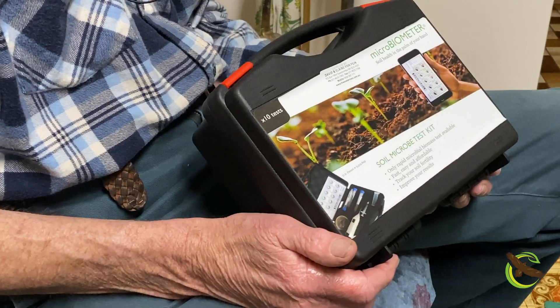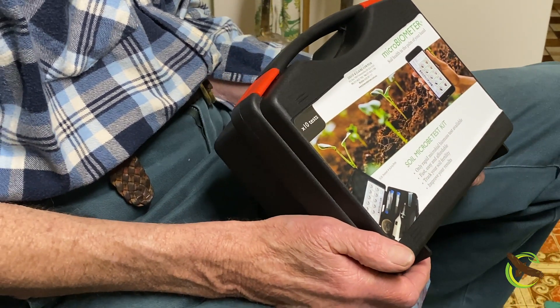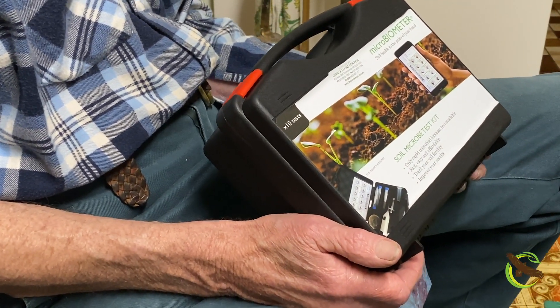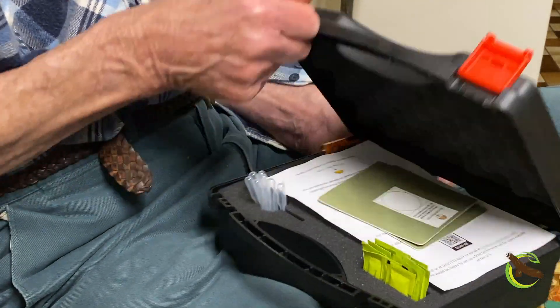Here we have the Microbiometer kit. These kits were developed in the US a few years ago by Prolific Earth Sciences and they are absolutely brilliant. You can do the total microbial biomass in your soil and the fungal-to-bacterial ratio in about 10 to 20 minutes depending on soil type, and they are so simple to use. A child can use them — the only technical thing at the end is an app on your mobile phone. I'll open the case up and show you.